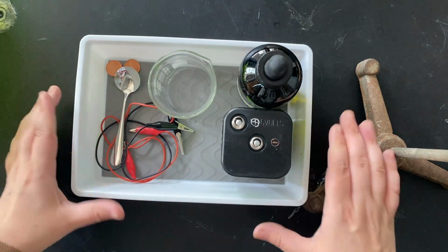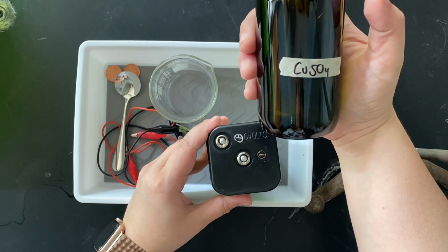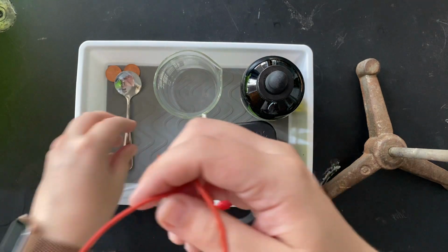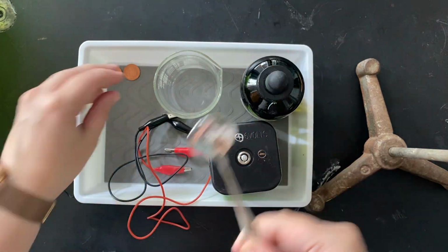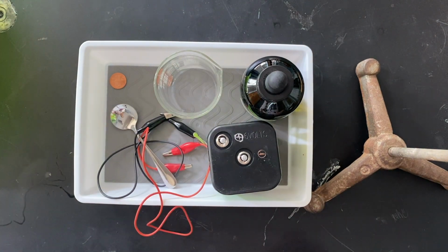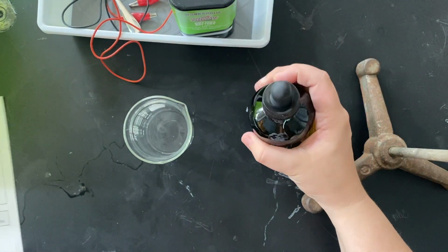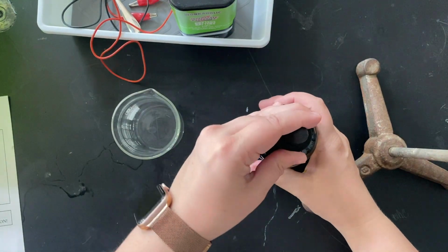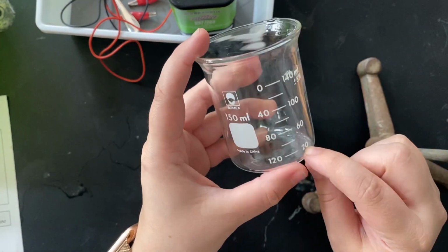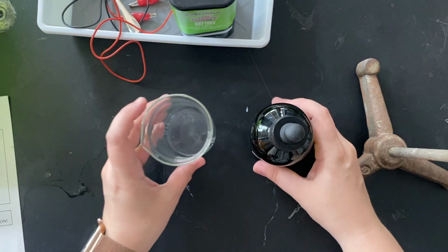So at your station, you'll have a bin that looks like this. You have a battery, a bottle of copper sulfate solution, an empty beaker, a red wire, a black wire, a spoon, and some pennies. So what you're going to do first is take your empty beaker and your copper sulfate solution. It says to pour about 80 milliliters of your solution. So looking at your beaker, 80 mils, starting from the bottom, is between 60 and 100. So we're going to aim for about that line full of copper sulfate.